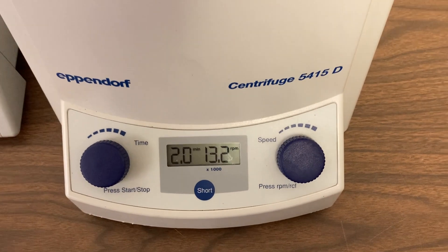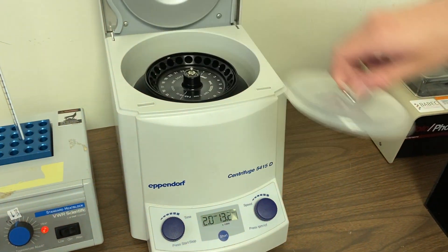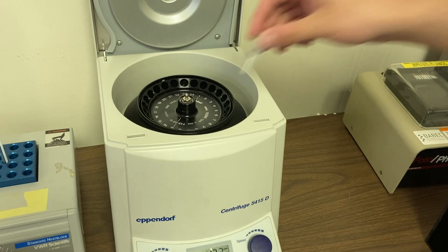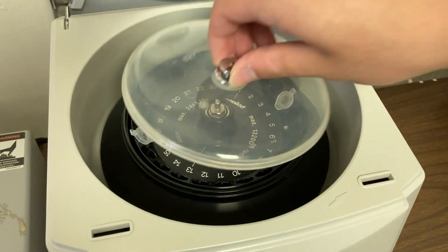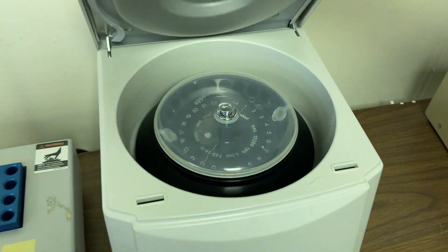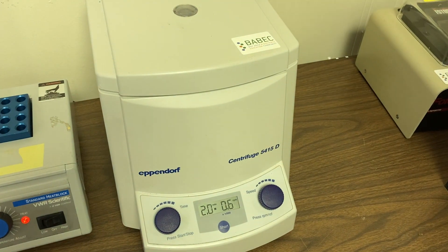In step 3, we'll be using a machine called a centrifuge. You can see that it's set at 2 minutes and will be spinning at over 13,000 revolutions per minute, or RPM. You set your cheek cells in your microtube on one side and balance it with another microtube on the other side, and you'll start the machine.